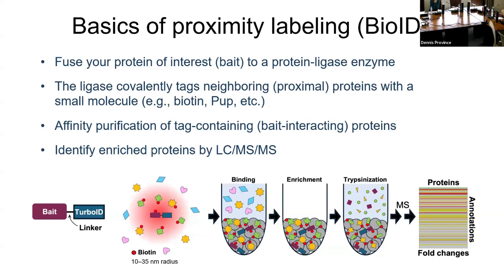The one thing that this is a little bit accurate about is that this biotin right here, and the portion that's directly attached to the biotin that isn't cleaved off, probably is just staying on the beads, because it's my understanding that you do not detect very many biotinylated peptides here. And that was a total misconception I had when I started this. I thought, oh, we'll get biotin tagged peptides.